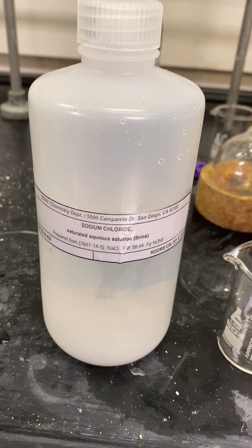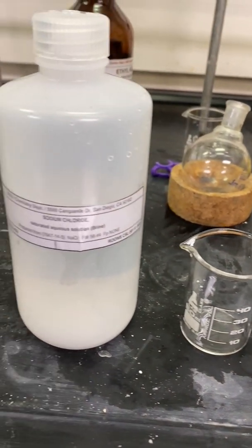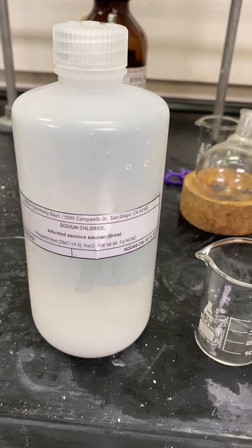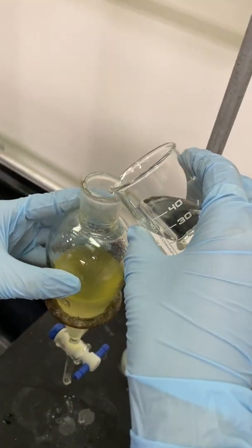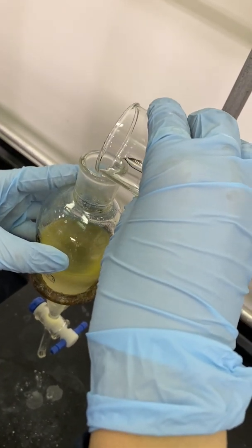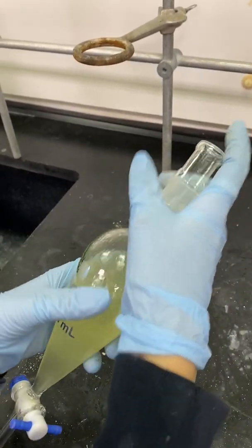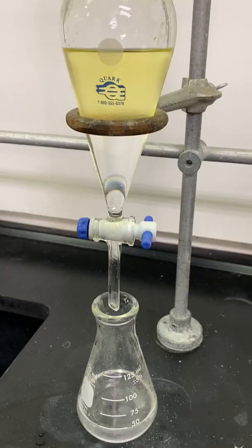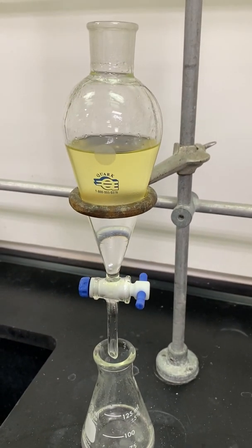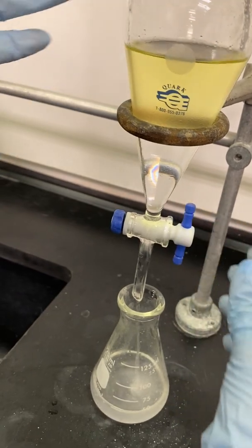I will now measure out about 20 milliliters of saturated sodium chloride solution, or brine, which will remove any excess water left in my reaction. I will add the 20 milliliters into my separatory funnel containing my product, then shake and vent the separatory funnel for a total of three times before draining the aqueous layer into the same 125 milliliter Erlenmeyer flask. This is the last step of my workup.